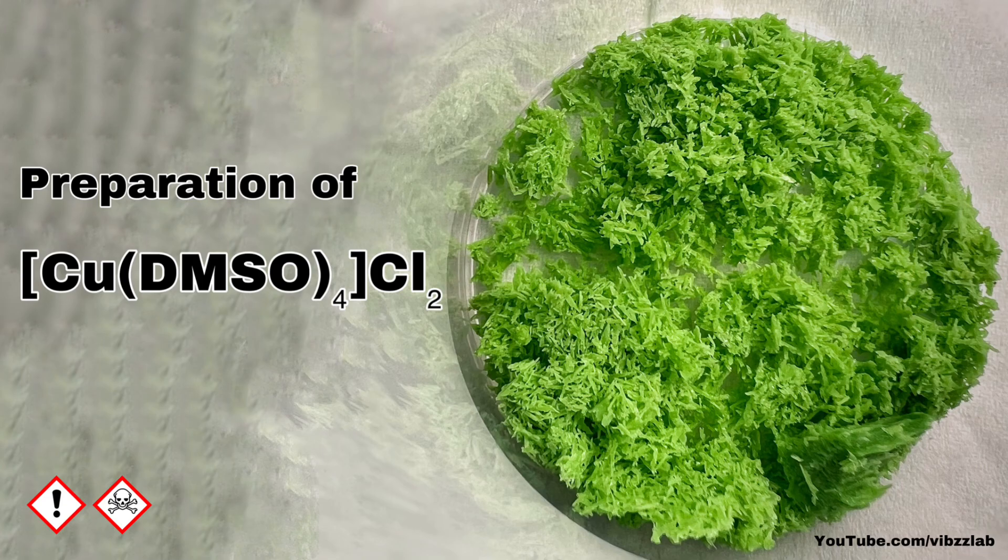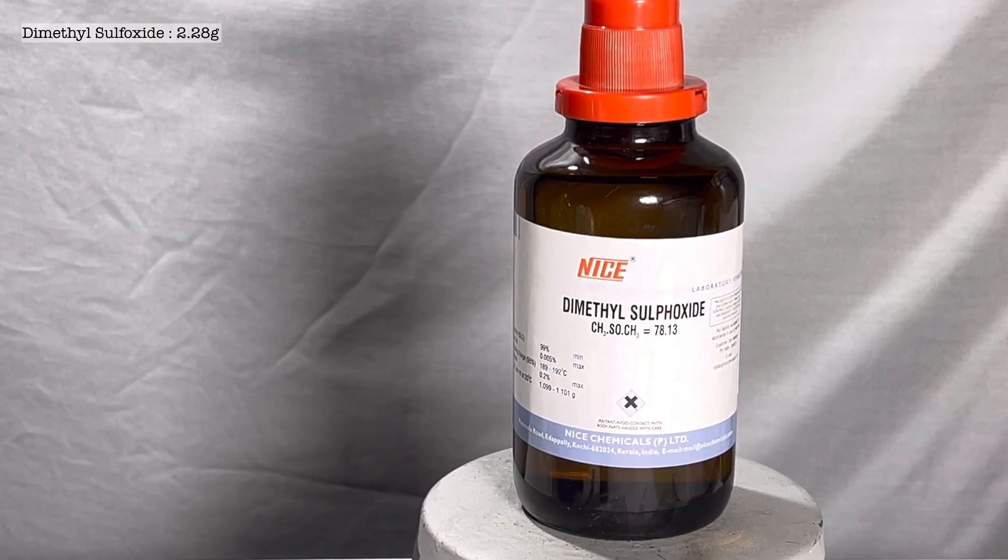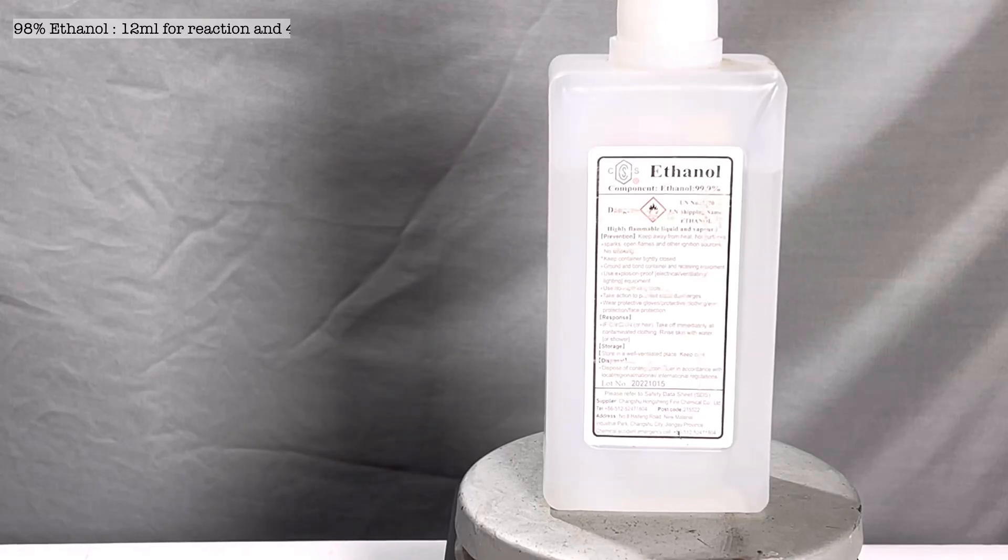Chemicals required are 2.28 grams of copper 2 chloride dihydrate, 2.28 grams of dimethyl sulfoxide, known in short as DMSO, and 98% ethanol. We will need 12 milliliters for the reaction and approximately 40 milliliters for the recrystallization.